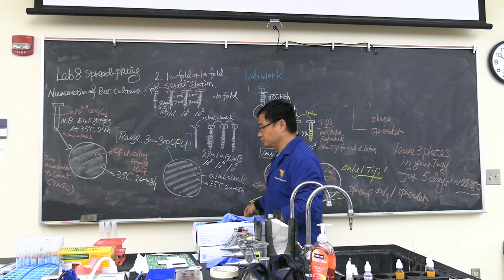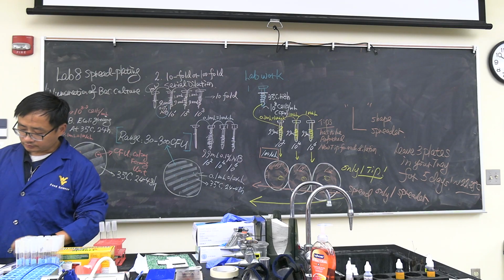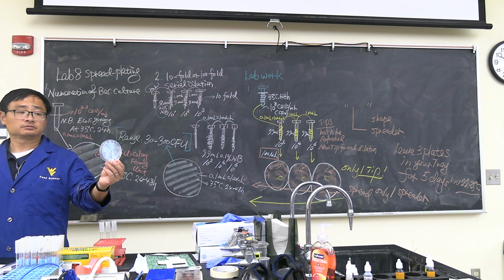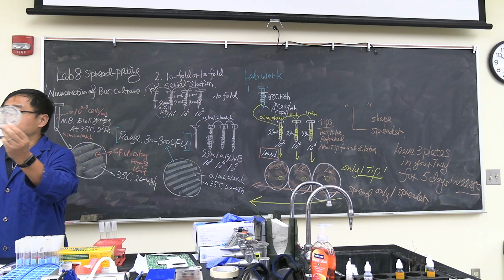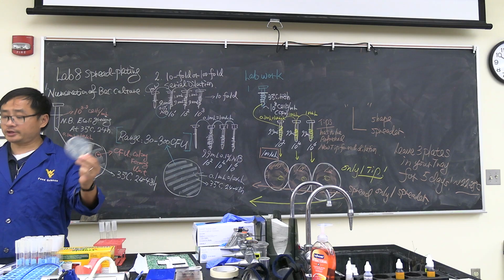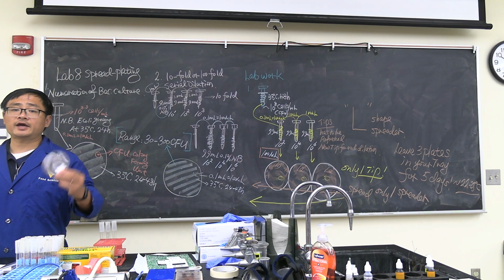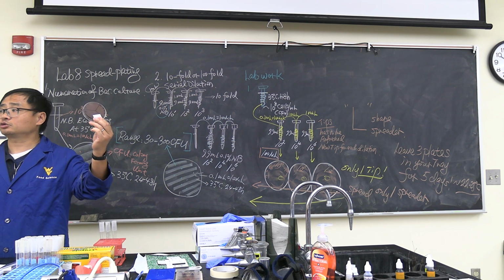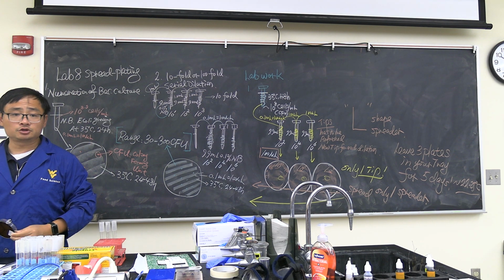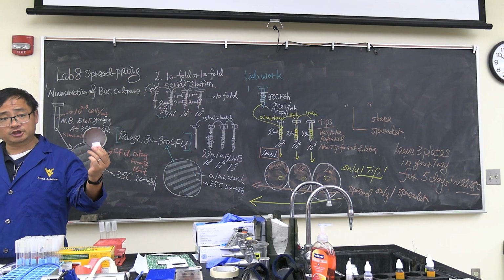Now, before I show you how to do, let's go over the results, what we have. First thing first, you have your nutrient broth, everything should grow. No question. Second, you have your blood agar, everything should grow. Because nutrient broth agar is a support media, blood agar is an enriched media. They should always grow.